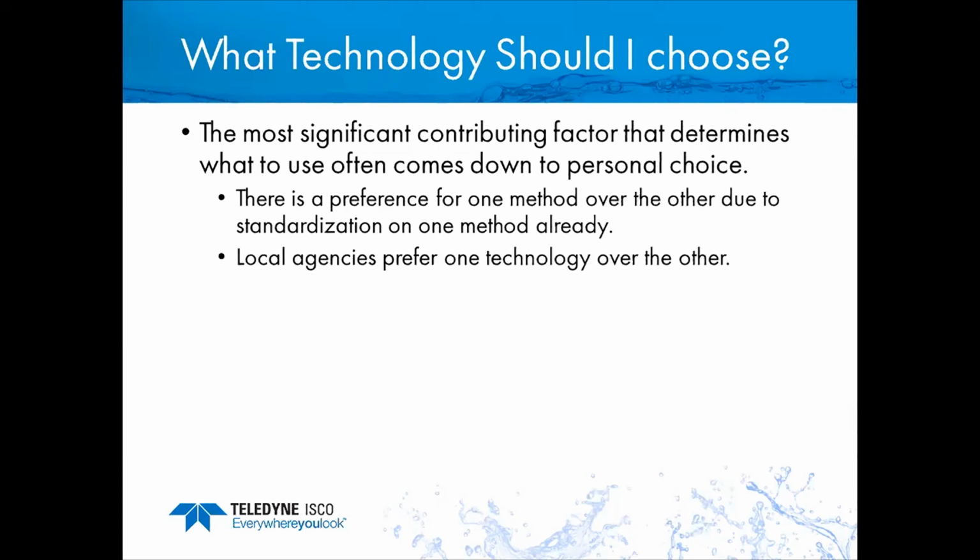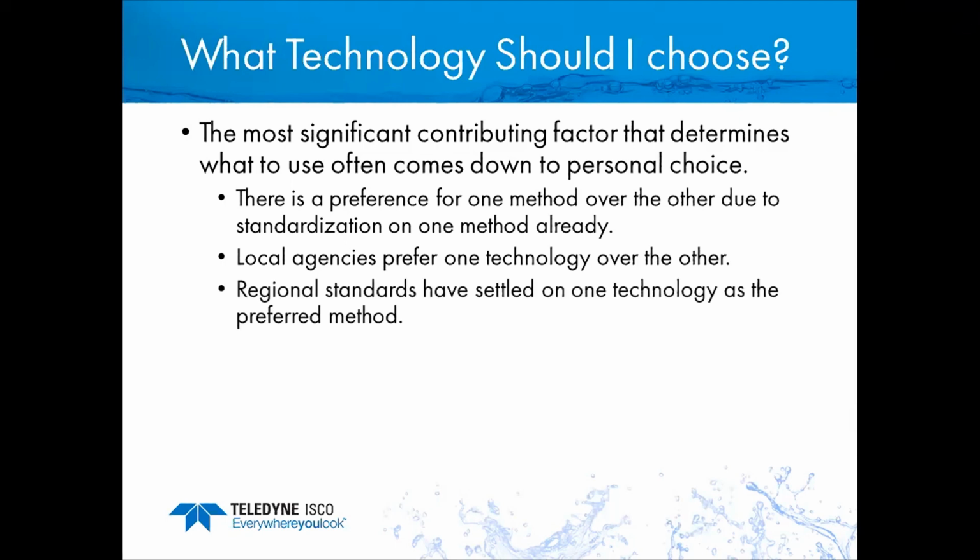Local agencies prefer one technology over the other, and they may stress the utilization of a peristaltic or a vacuum sampler.